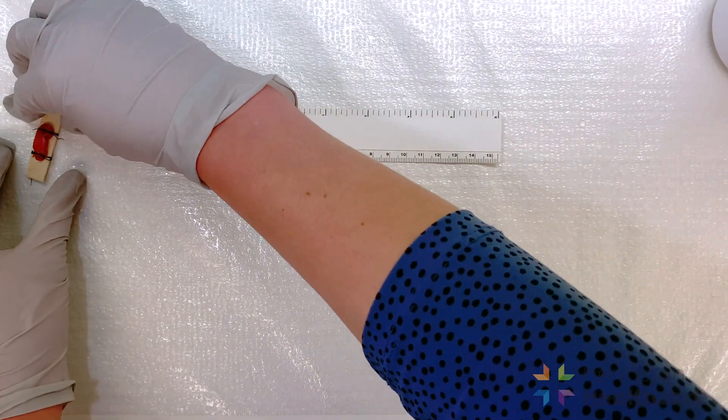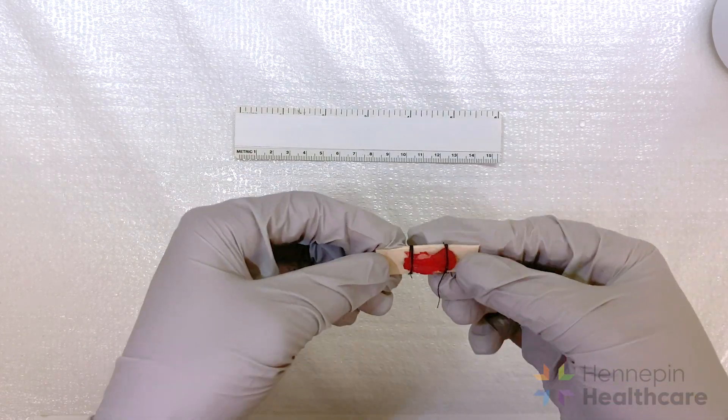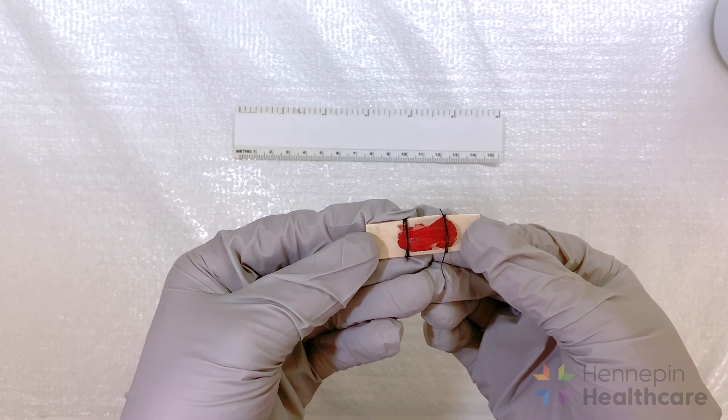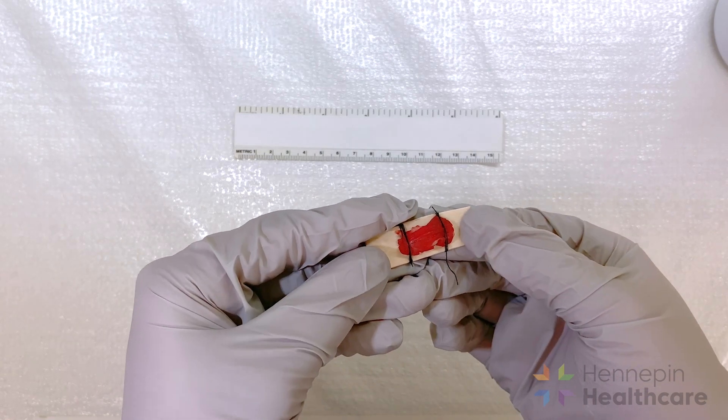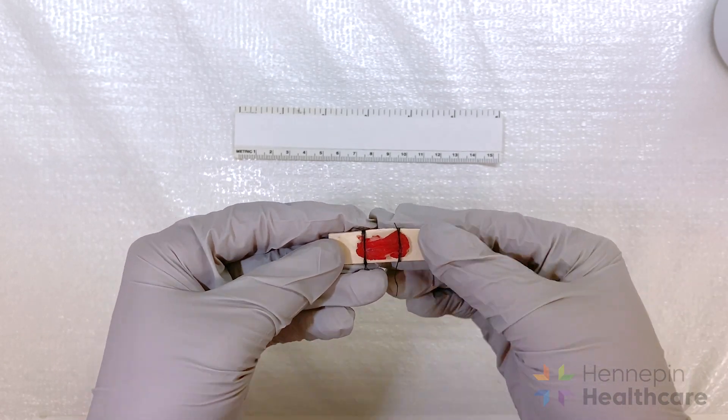The portion of the biopsy designated for electron microscopy should be sutured or tied to a tongue blade at resting length. We don't want to crush the tissue — we just want to hold the tissue flat at its relaxed length during fixation.